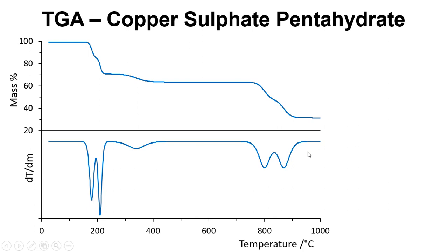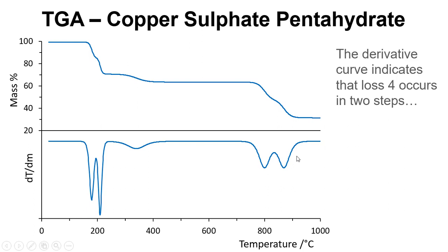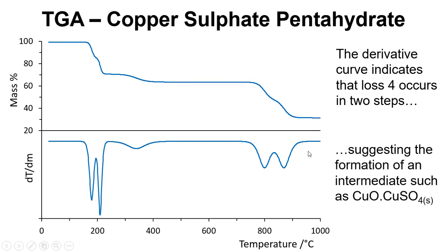If we look at the derivative curve for a moment, we can see that loss 4 occurs in two steps, which suggests the formation of an intermediate, maybe something like CuO·CuSO₄.